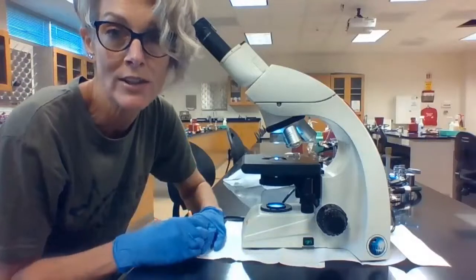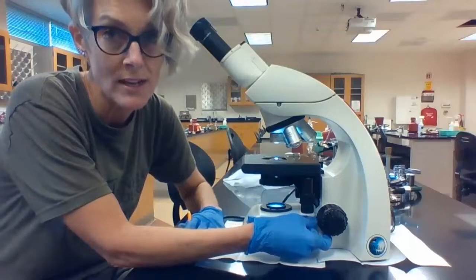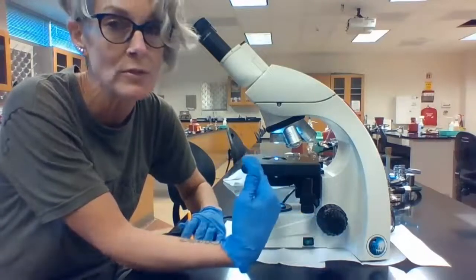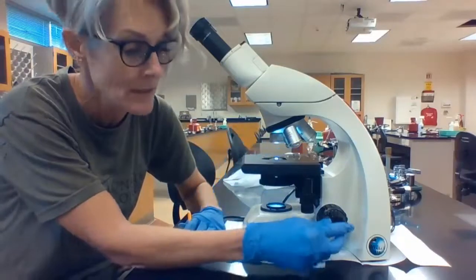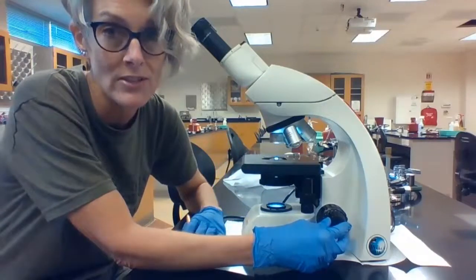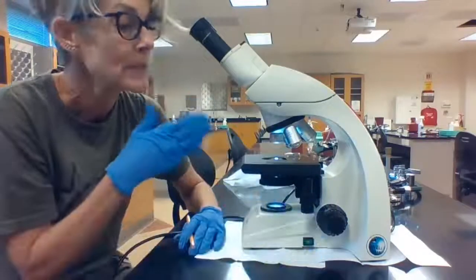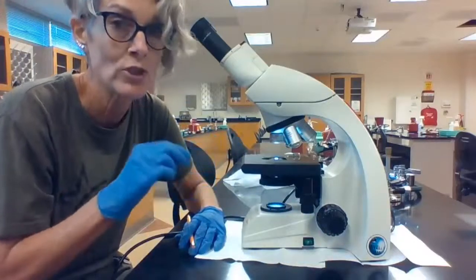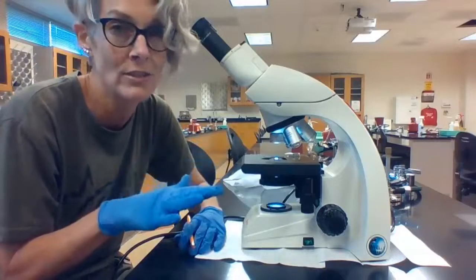There are two focus knobs on this microscope. The inner knob is called the coarse adjustment knob. This is what you're going to use when you're just placing your specimen onto the stage and trying to get it into view for the first time. The outer, smaller knob is the fine focus. This is what you're going to be using when you go between lenses. These scopes are parfocal — they're not perfect, but when you change lenses and increase magnification, you shouldn't have to adjust them too much.